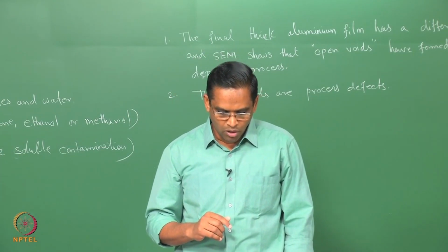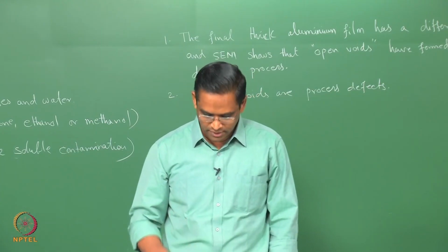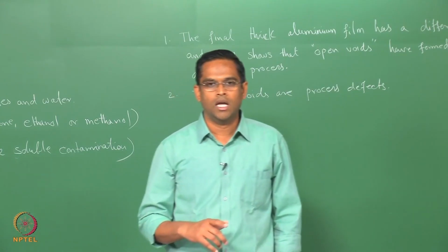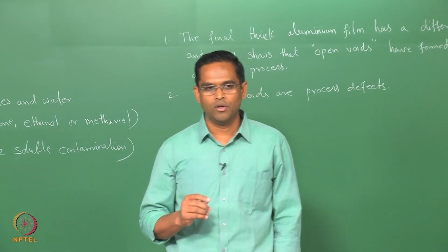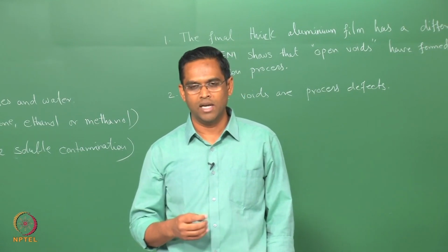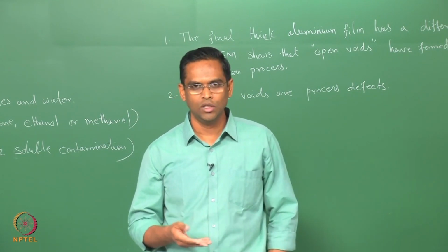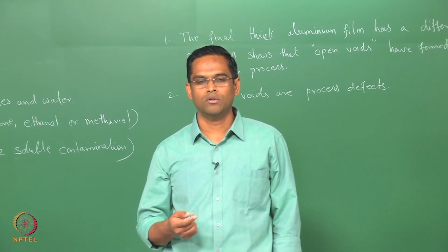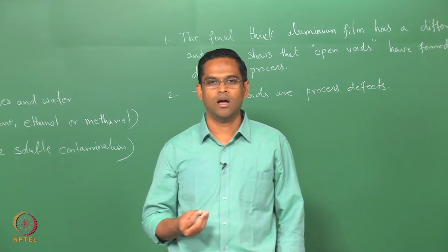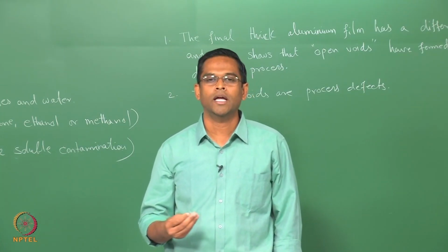So, what I want to conclude from this session of the tutorial is, first of all, you have to choose what kind of micro analysis you want to do, whether you want to find out the light elements or higher atomic number elements.